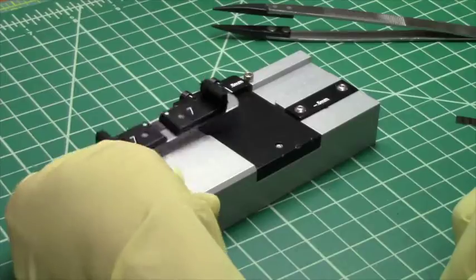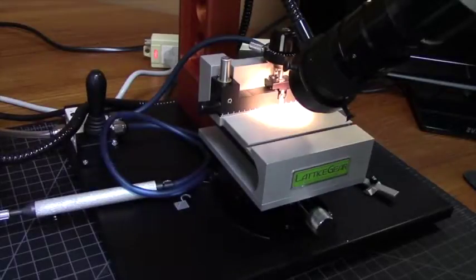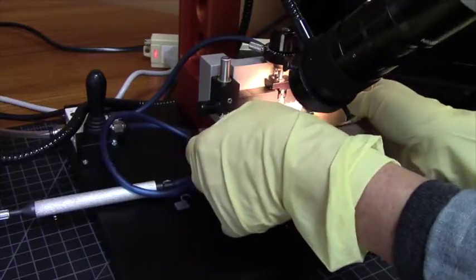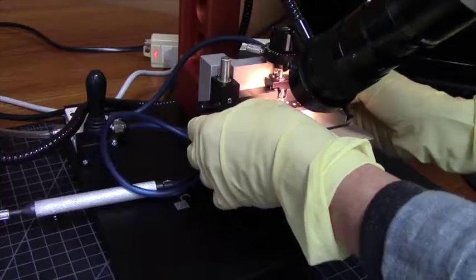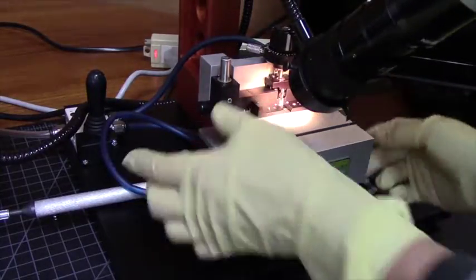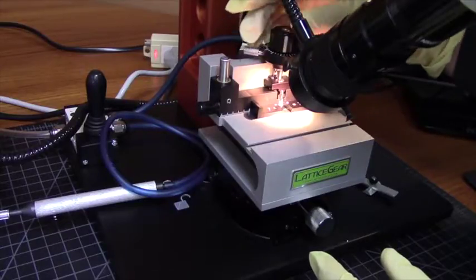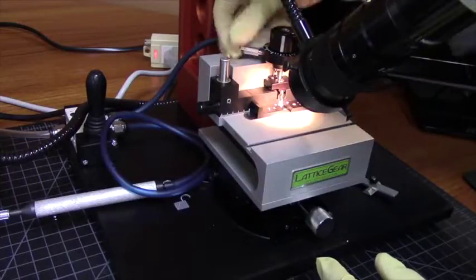Once in the holder, I will now indent the sample using the Lattice X. I've moved this sample to the Lattice X in the hold down and I'm going to position it for indenting. I'll position the indenter over the area of interest and indent, just as is normal.